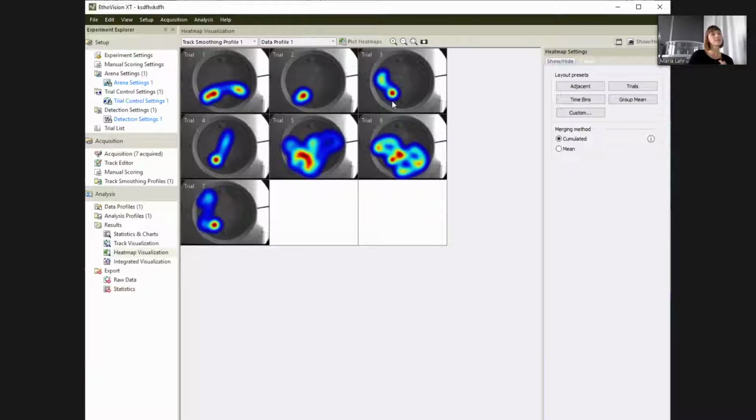And when the mouse is very good, you see, okay, here's obviously the platform, because we have included in the tracking that we did the last 2 seconds. So maybe the last 2 seconds are not so good for us to analyze, because maybe they are destroying our data. So when we analyze something, we might need a bit different paradigms or set our parameters in a bit different way.